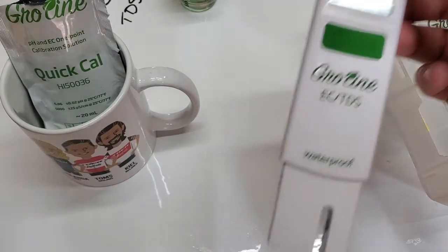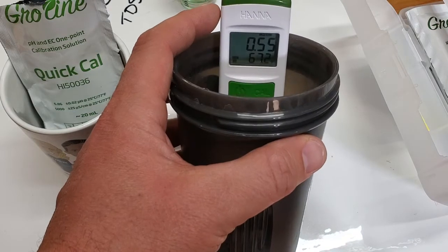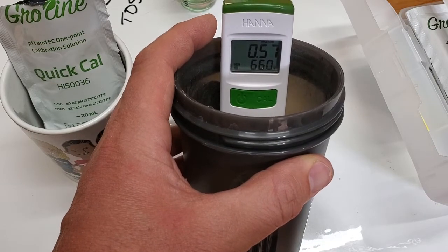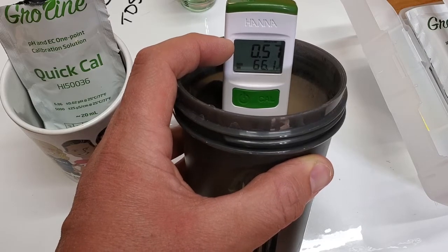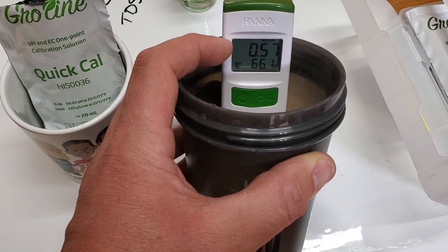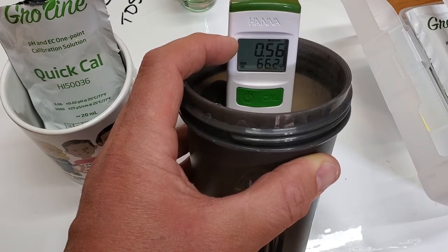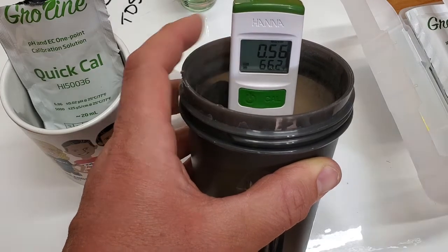So now I've got some municipal water here. It gives me the temperature and the EC. As soon as this little timer stops blinking, that lets you know that it's as accurate as it's going to get. We're at 0.57 EC, which on the 500 scale would be about 275 parts per million, and 66 degrees.